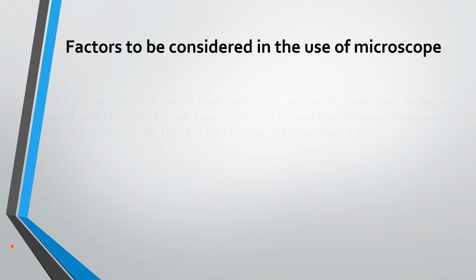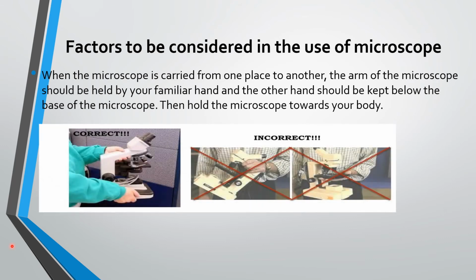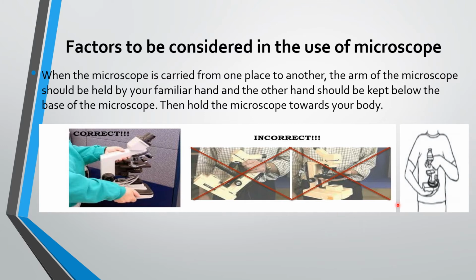The first and the main thing is the handling microscope or carrying microscope from one place to another. So if you are going to carry the microscope from one place to another, it is a must to use this method in handling it. මයික්‍රොස්කෝප් එකක් එක තැනක ඉඳලා තව තැනකට ගෙනියනකොට මෙන්න මේ රූපේ දක්වලා තියෙන විදිහට තමයි ඒක අපි අරගෙන යන්න ඕනේ.